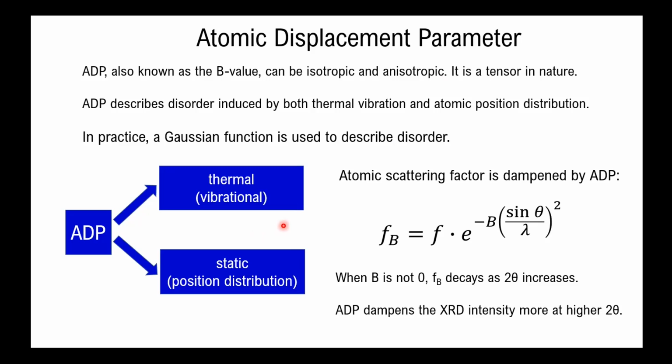But if we have a very large number of atoms and count their positions, in most cases, not all cases, they would form some kind of Gaussian distribution, meaning that most atoms lie almost exactly on the exact position, but once the position is a little bit off the perfect position, the percentage of atoms in the total will sharply fall off, following a Gaussian distribution.